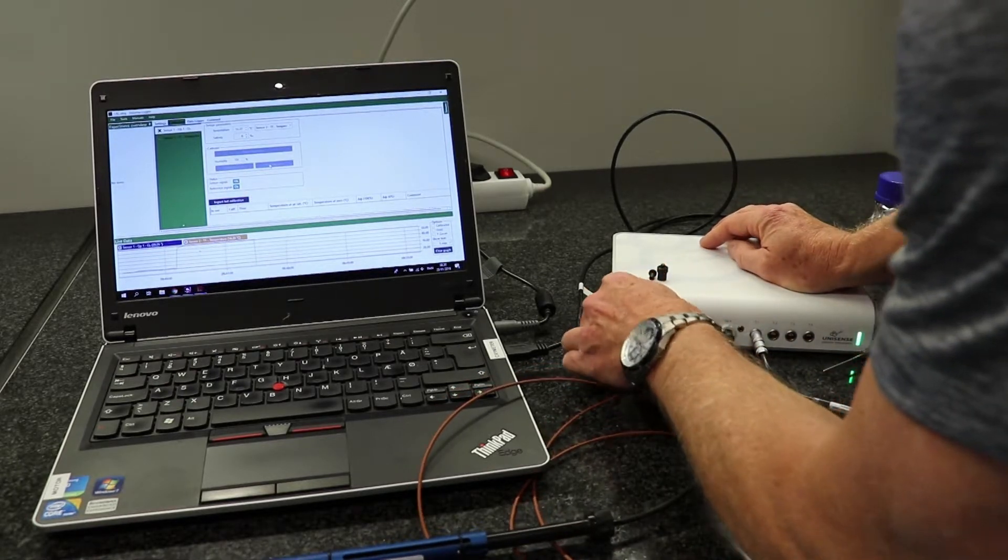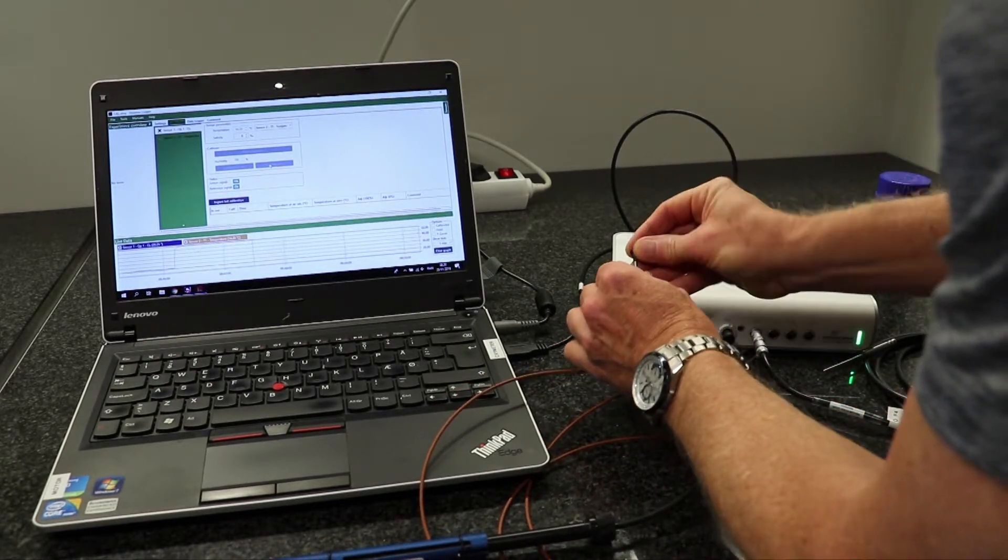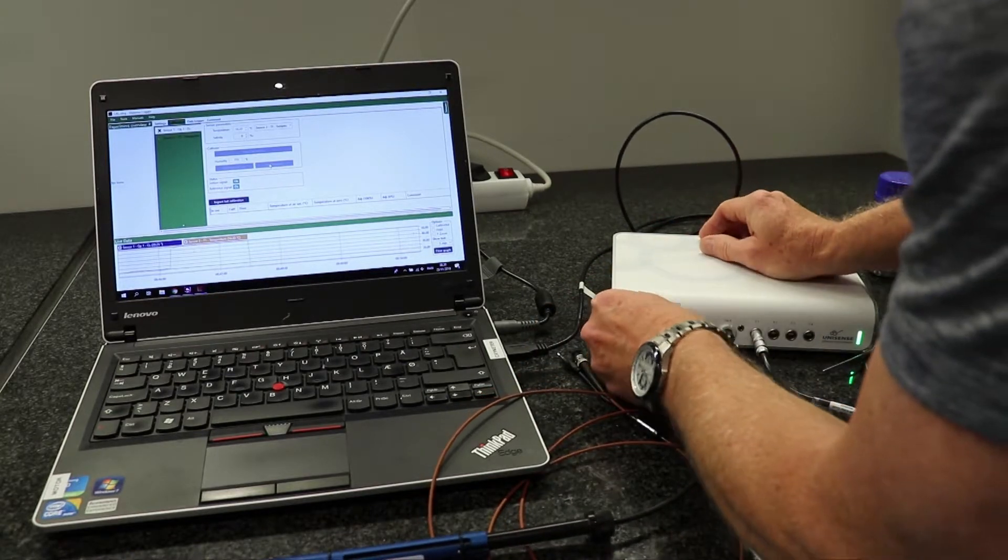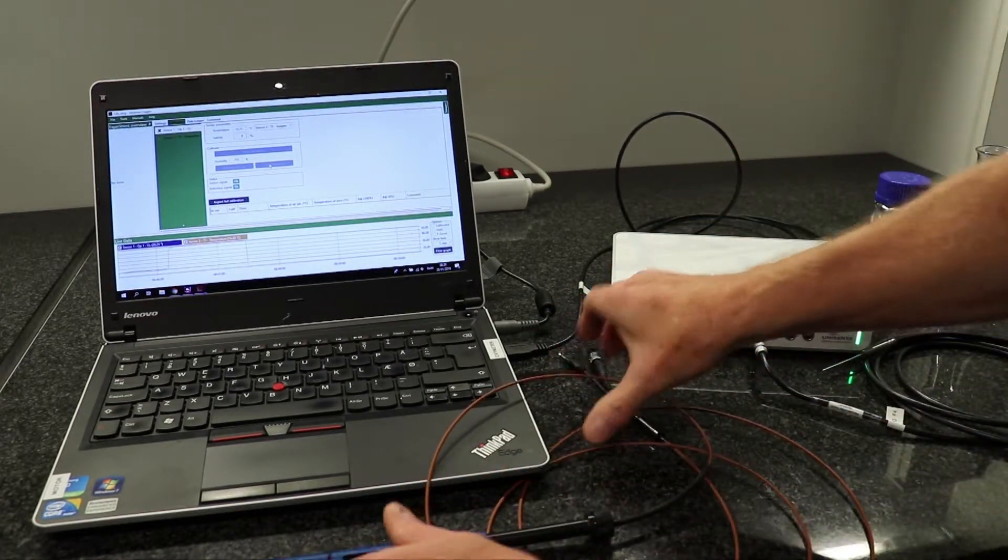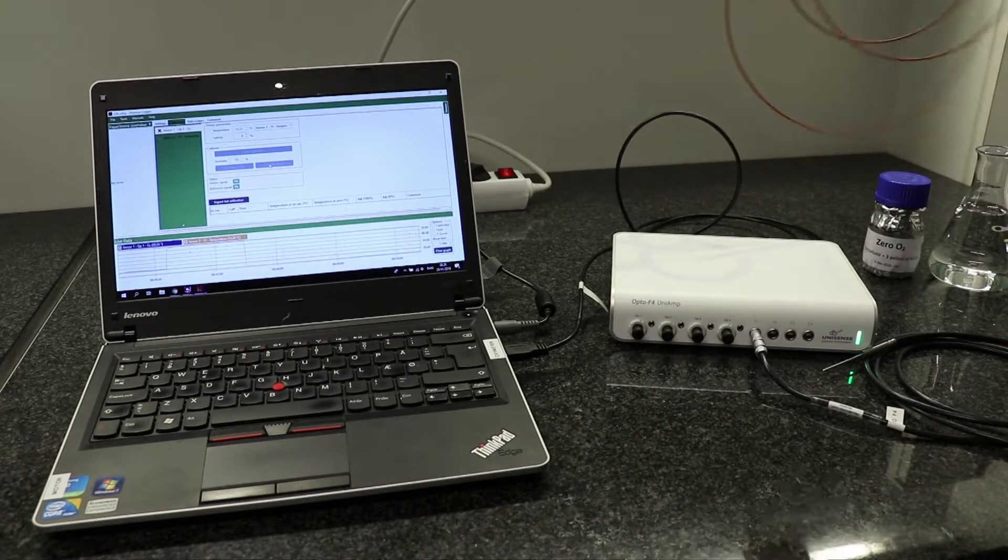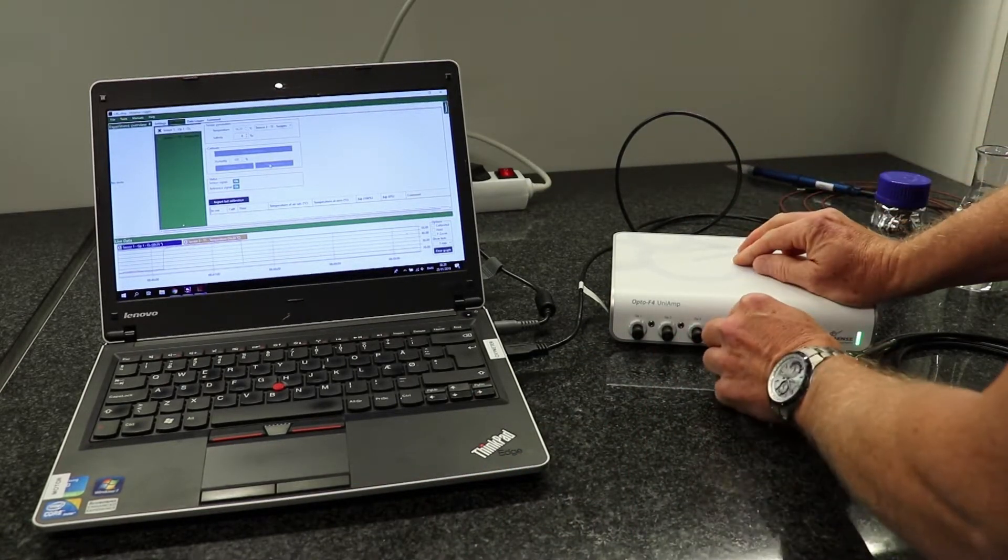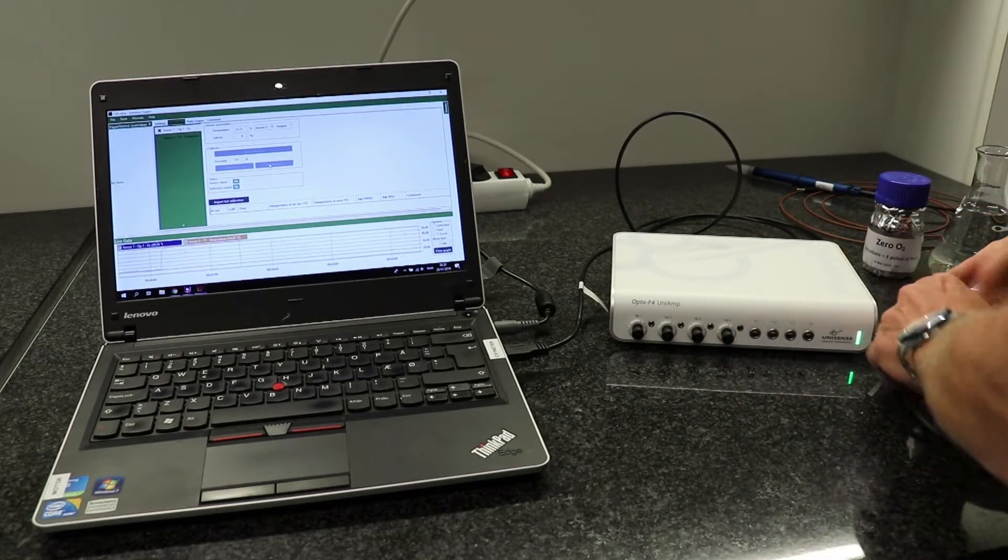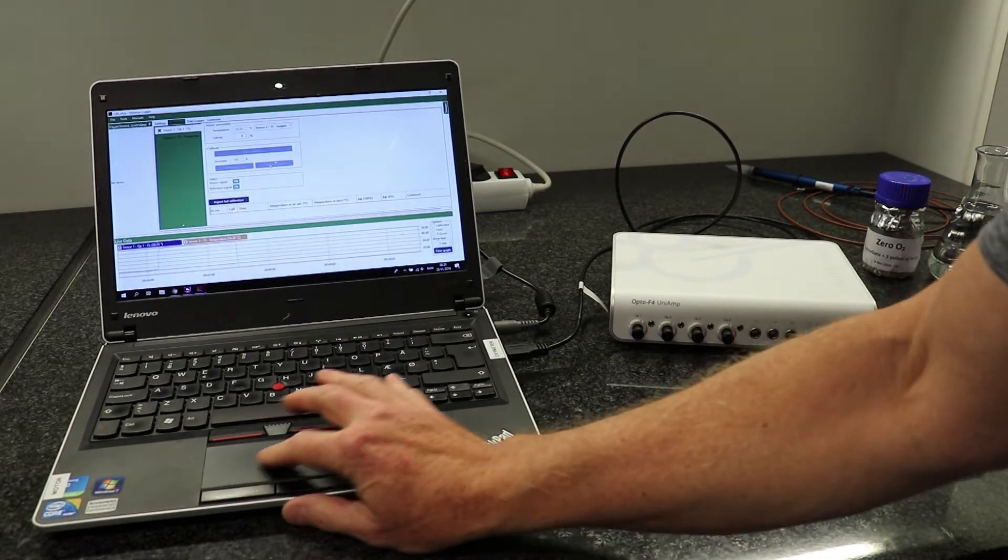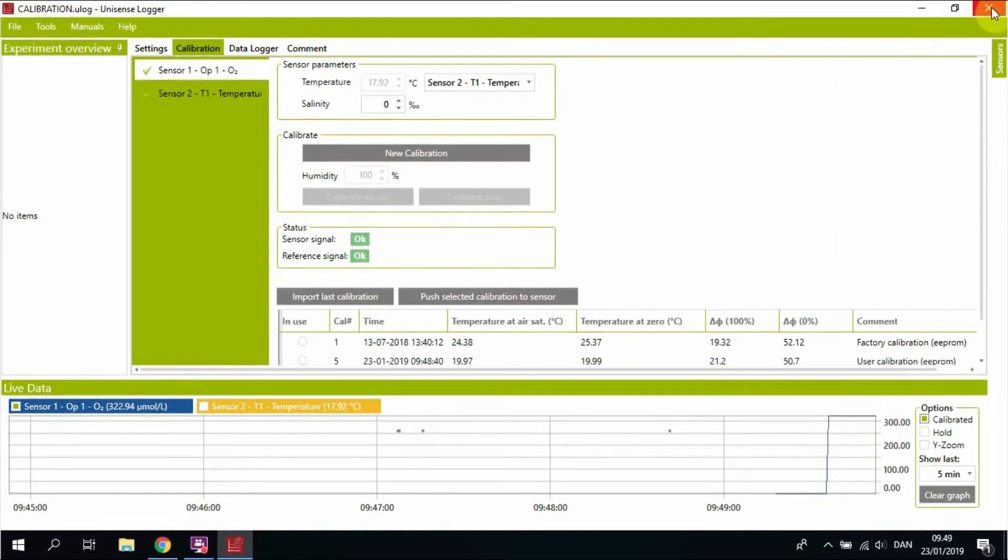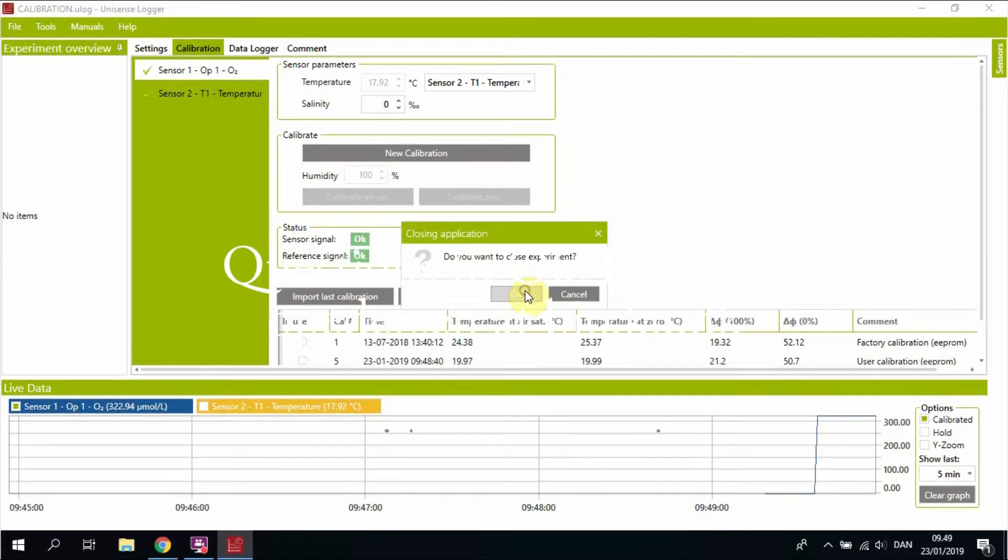Once you have completed your measurements, disconnect in the same order as you connected. Always remember to mount the dust caps so we don't get any dirty optical connections. And you close the software. It warns you, but everything is saved already, and you can always open your session and extract the data.